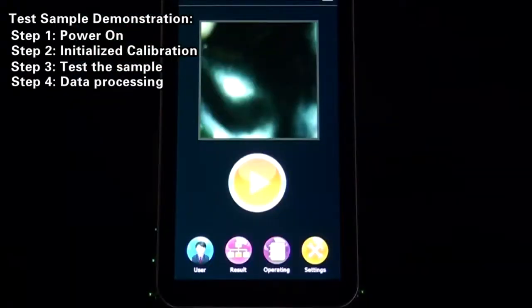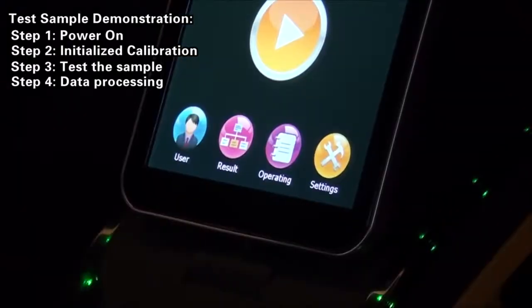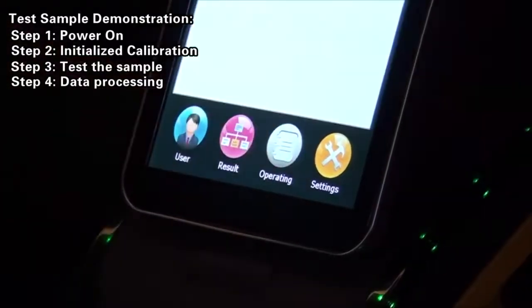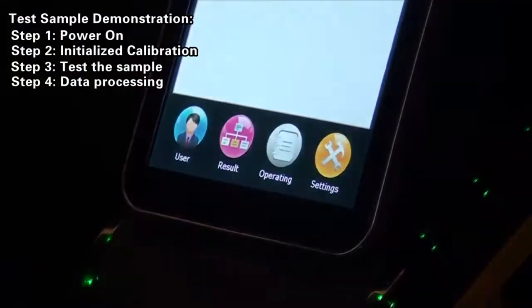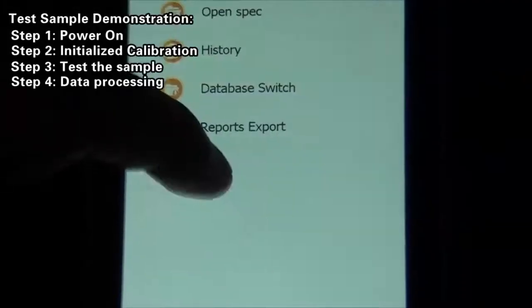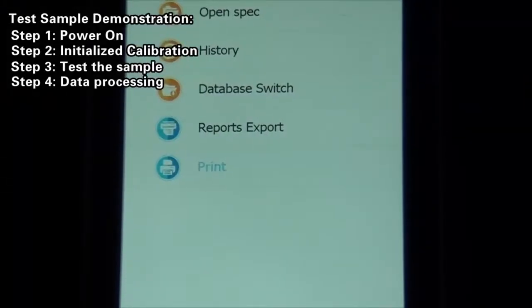Step 4: Data Processing Report Print. Click Operate Print button to get connected to the Bluetooth printer and print the test report of the current sample.